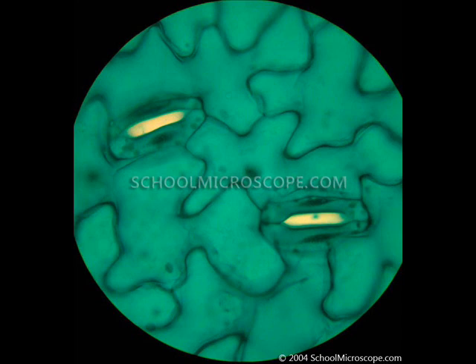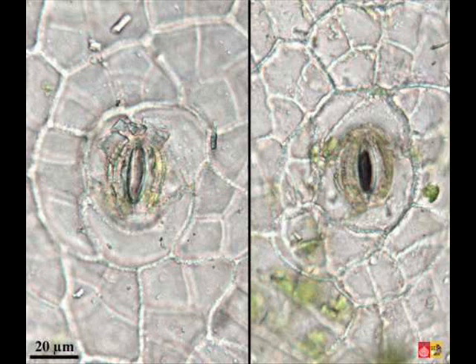These are the stomata on high power, which is 400x, and here you can see them quite closed — they're flatter, with only a line in the middle. They're not wide open like the other stomata we saw. Please make a detailed sketch of these closed stomata at 400x. I also want to show you one more image comparing closed and open stomata: closed is on the left and open is on the right. Can you see the difference?